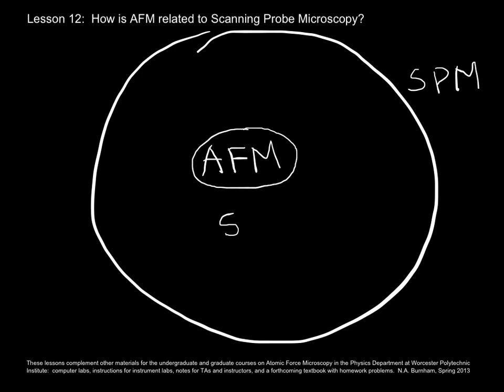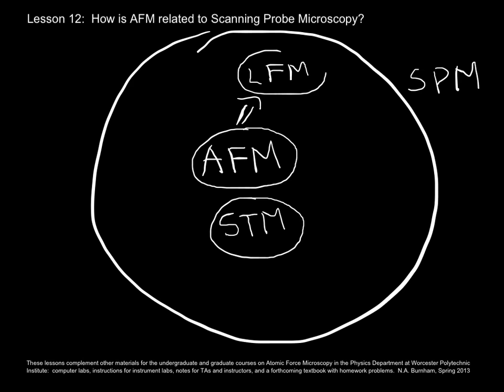So one probe microscope that I will mention is scanning tunneling microscopy. And one variant of AFM that I'll mention is lateral force microscopy. I'll be doing lessons on each of these.